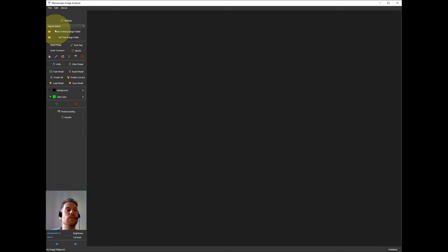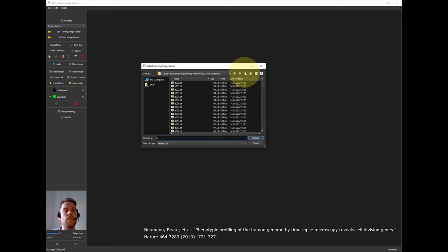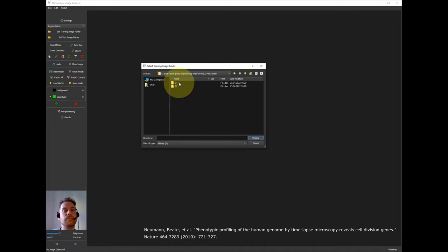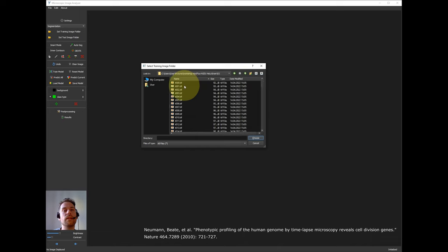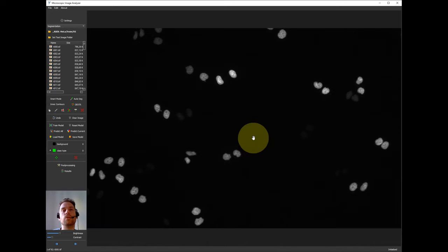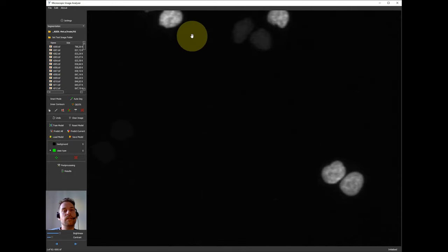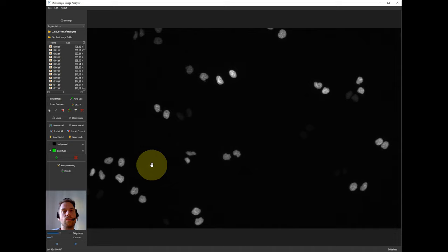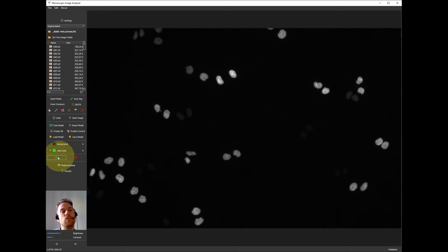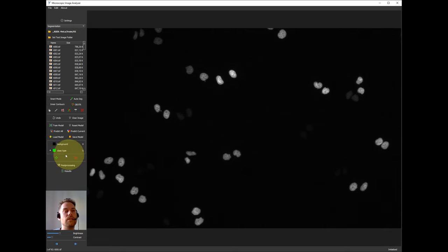The first thing that you need when starting training is to set a training image folder. What I'm using here is a public data set which consists of two time series for training and two for testing. I'm going to use these to demonstrate the software capabilities. This is an image from the first time series of the training set. You see there are stained H2B nuclei from HeLa cells. The first part would be to identify the nuclei. And in the second one we can try to identify cells that are in cell division.